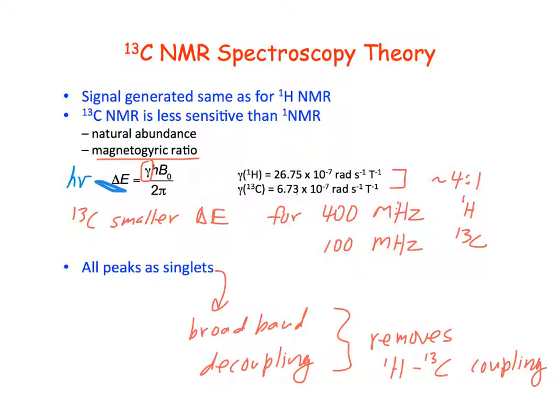You're referring to just when we look at a proton NMR spectrum, why don't we see coupling to the C13 carbons? Is it too small to see? Yeah, basically because only 1.1% of the carbons are NMR active. You can see satellites. Yeah, so the satellites, exactly. That's what the satellite is.